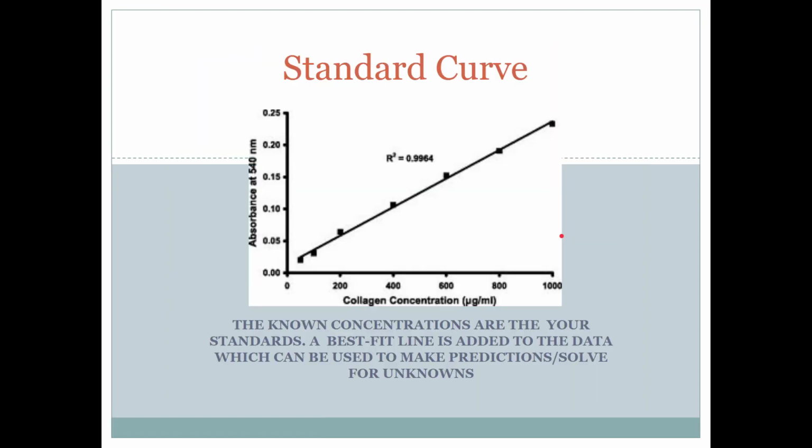All right, so you have the background you need now for a hypothesis. So what are we going to do? We are going to make a graph then. So what would have happened in class is you would weigh the potatoes, or take the mass of the potatoes, before they go into solution and after they go into solution. Okay? And you would look at how much they gained or lost mass.